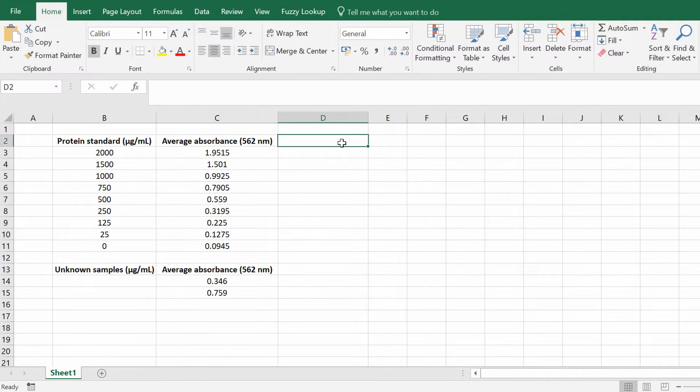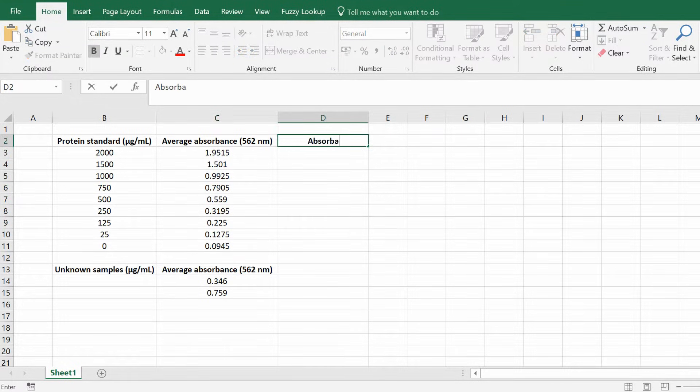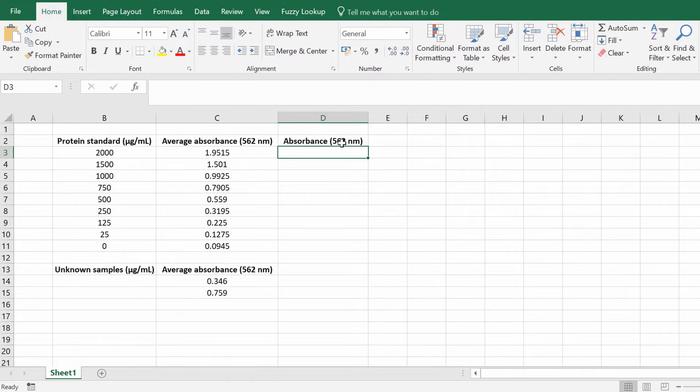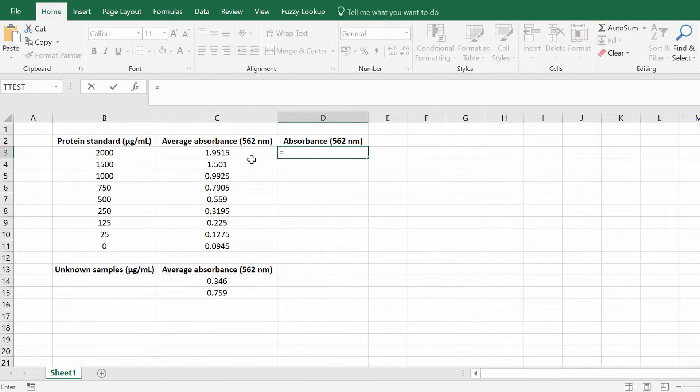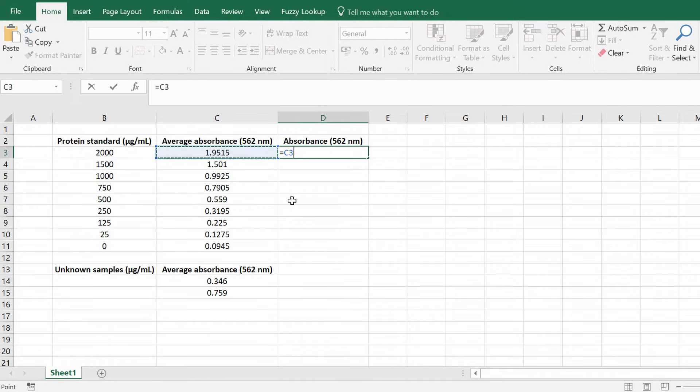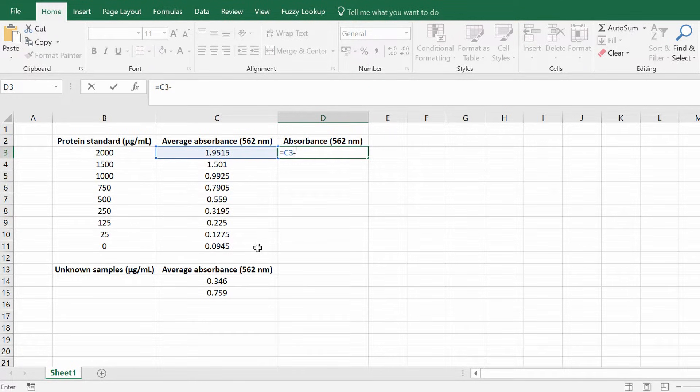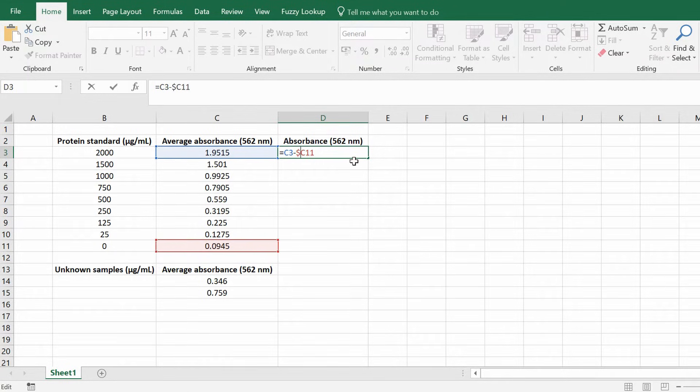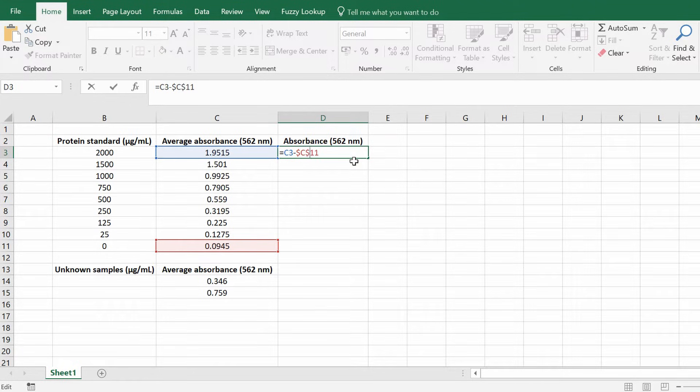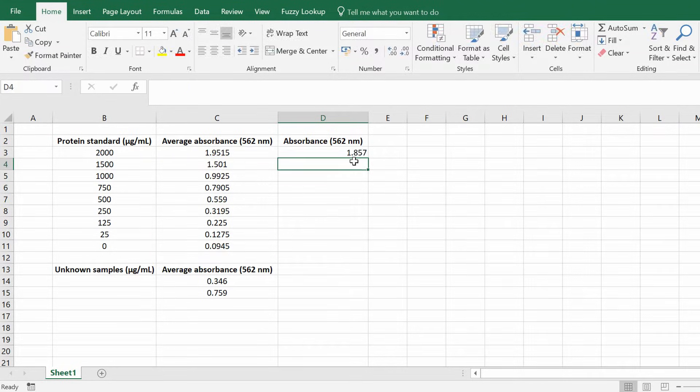Now what I'm going to do is create a new column and just simply call this absorbance. And then what you want to do is in Excel you want to enter equals, select the first cell and then minus the background cell. Another trick that you should do which will make sense in a minute is by inserting a dollar sign before the column letter and after the column letter and press the return key.